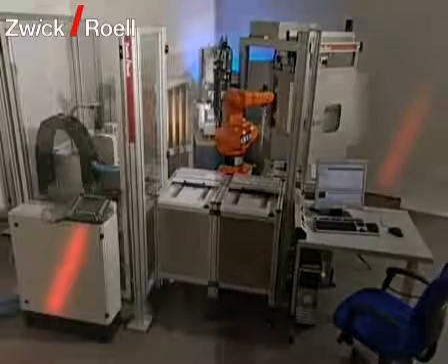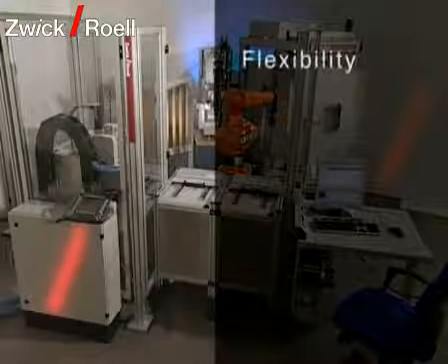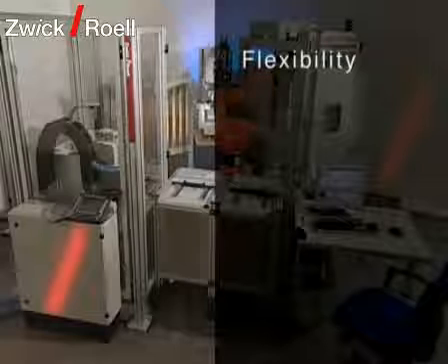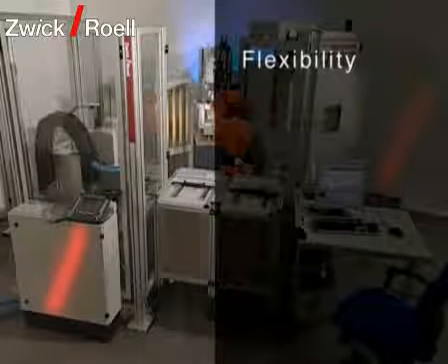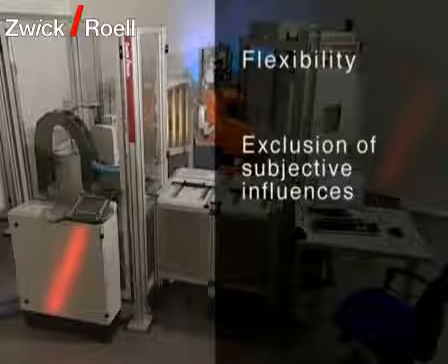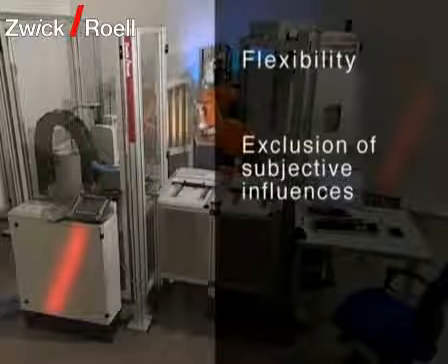Because of its modular structure, several pendulum impact testers can also be integrated in the testing machine or built in later on. Due to the high positioning accuracy of the automatic specimen feeding system, subjective influences are excluded. The reproducibility is ensured.